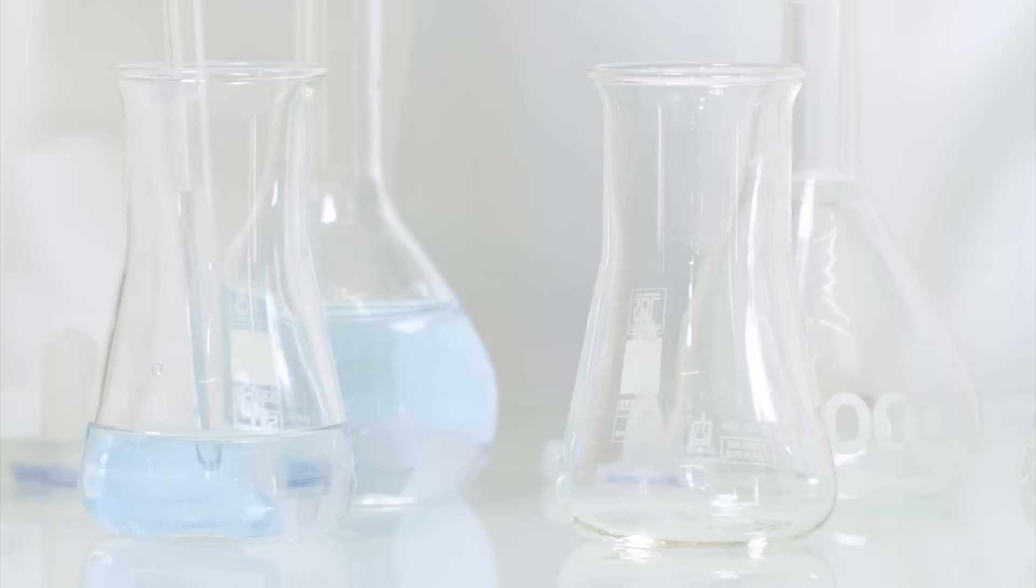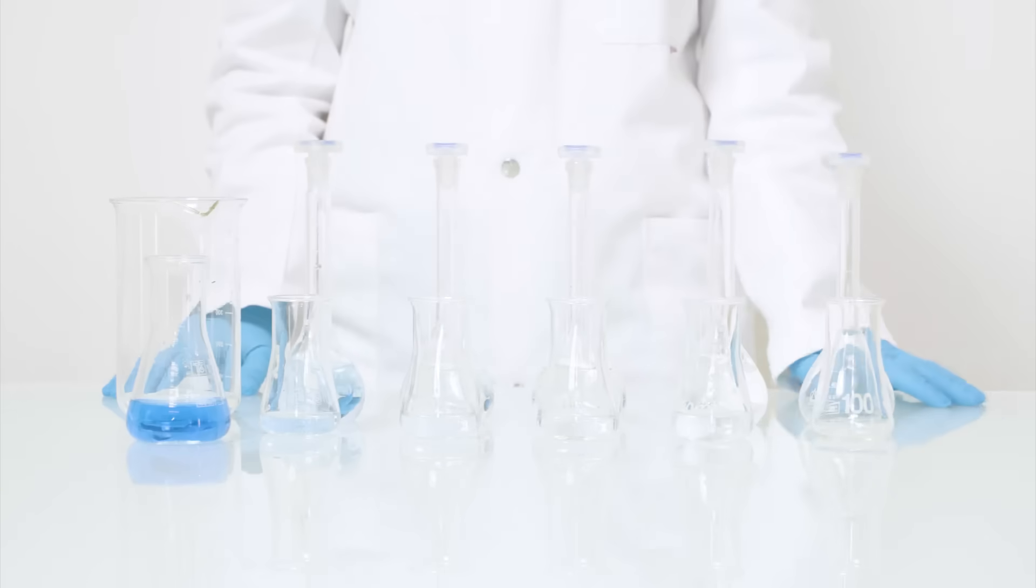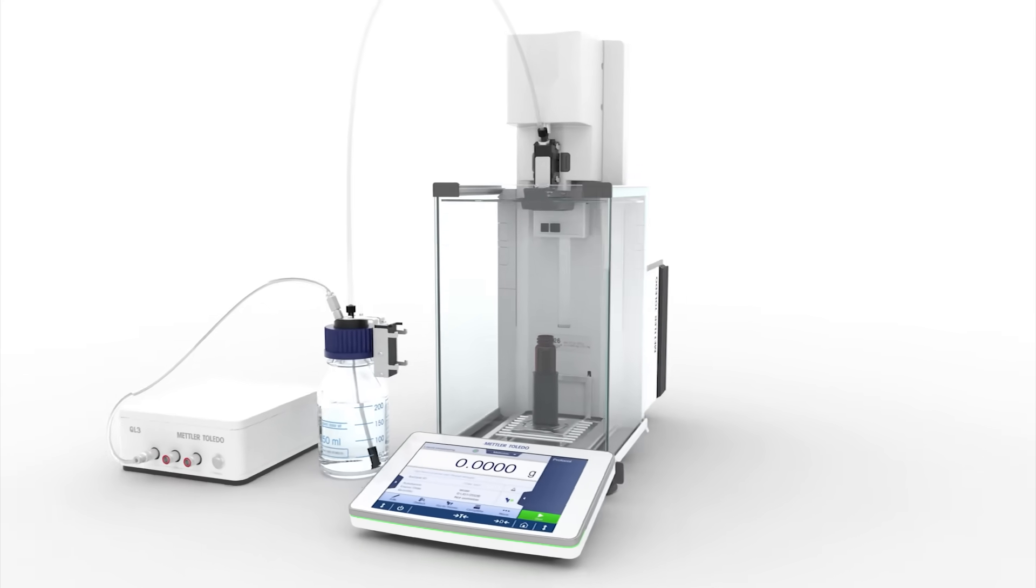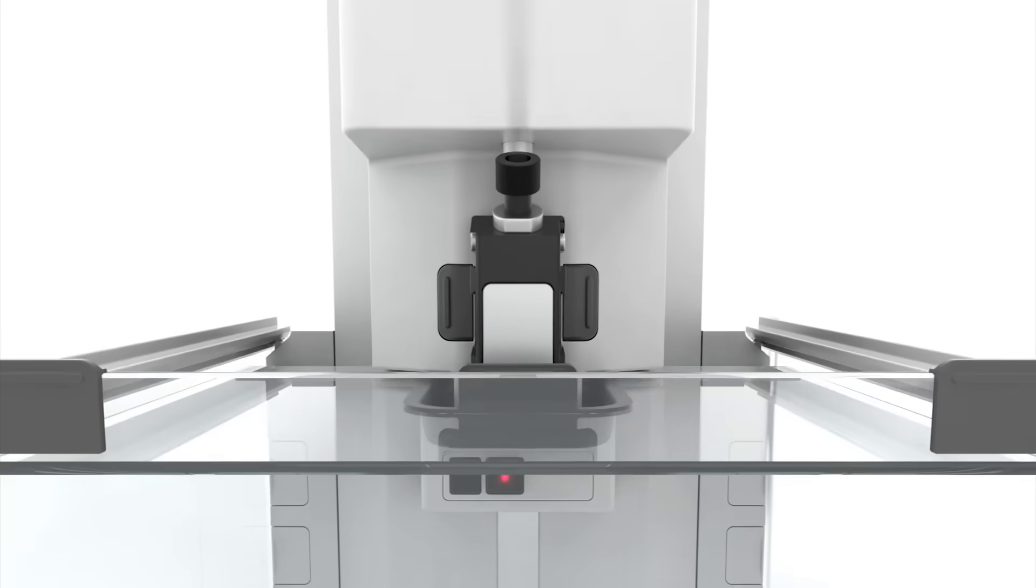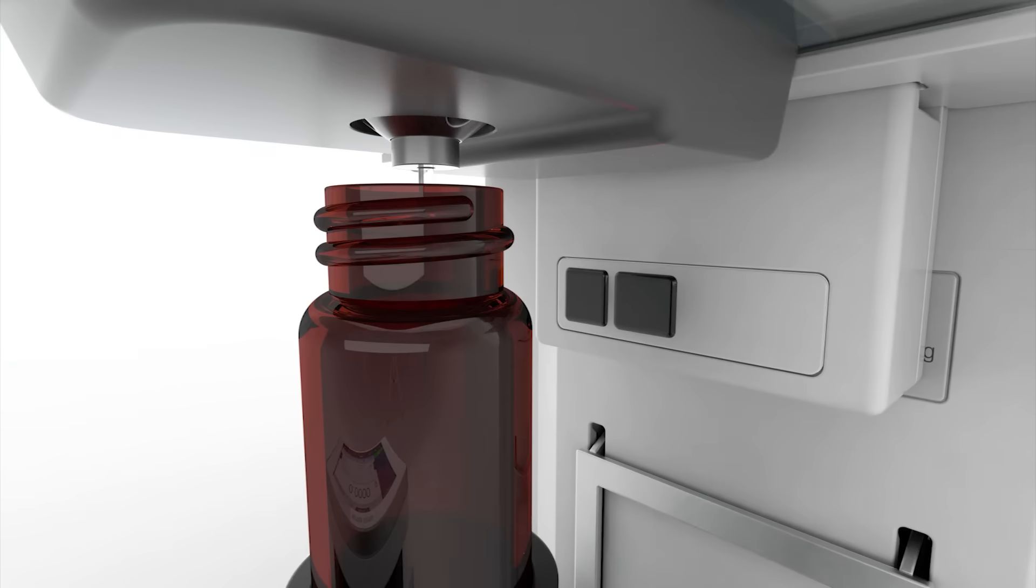Well, now you can forget the old and tedious way of preparing dilution series using pipettes and volumetric flasks. Make the switch to an automated gravimetric method with the XPR automatic balance, which offers fast, efficient, and safe automated liquid dispensing.